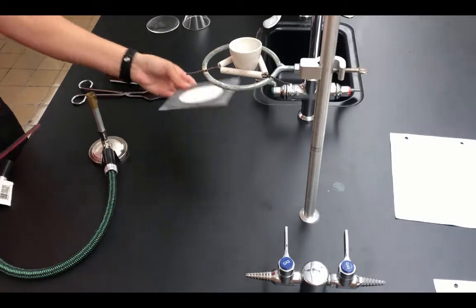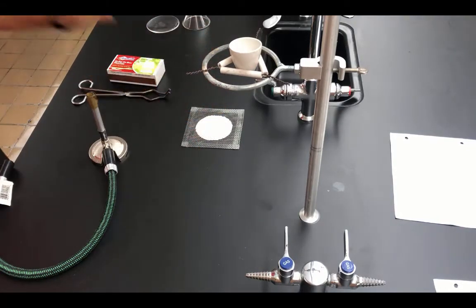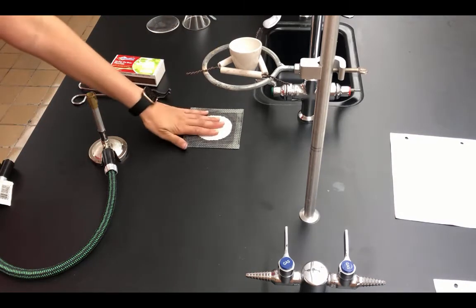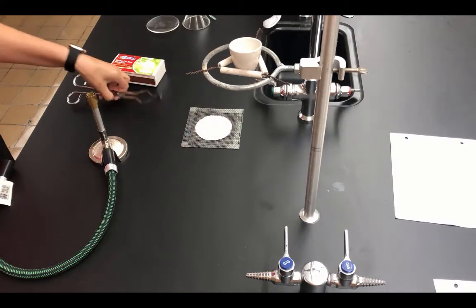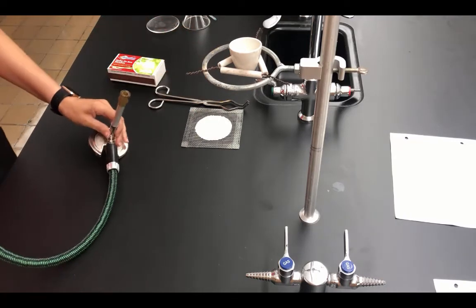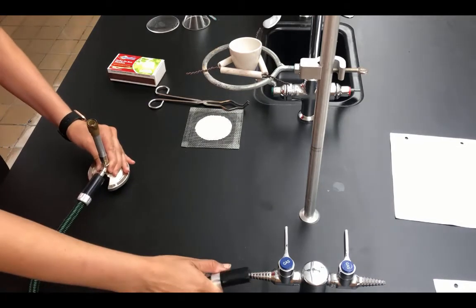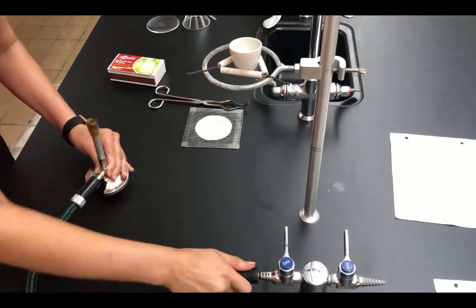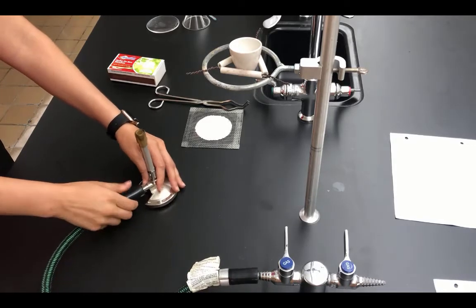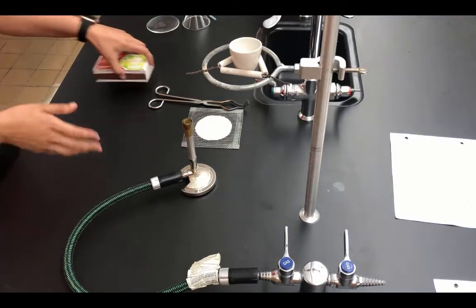I'm going to leave this heat-resistant ceramic pad just next to my setup. When my crucible is ready to cool down, I'll just set it right on the ceramic pad, and I have crucible tongs that I will use as well. What I'm going to do is set up the Bunsen burner underneath this ring stand. I have the Bunsen burner that I've gotten from underneath the lab table. I'm going to connect it to the gas, and I just want to turn the hose enough so that it sits correctly on the lab table.